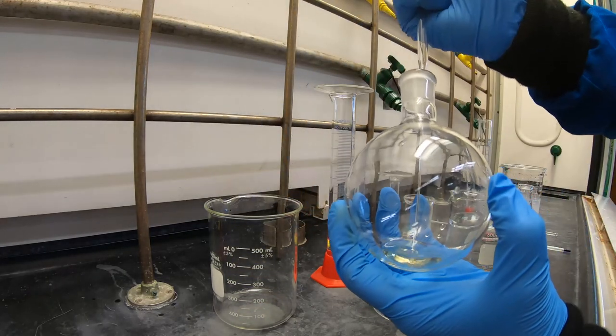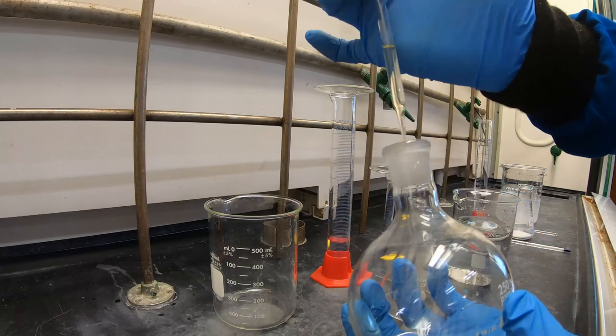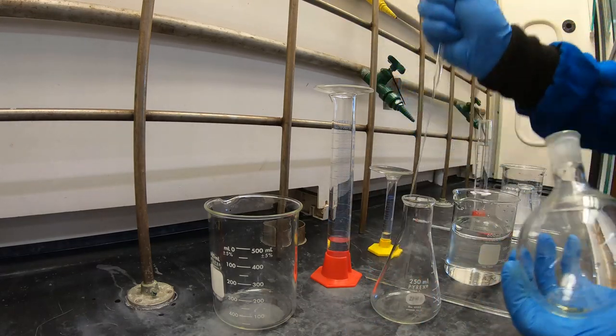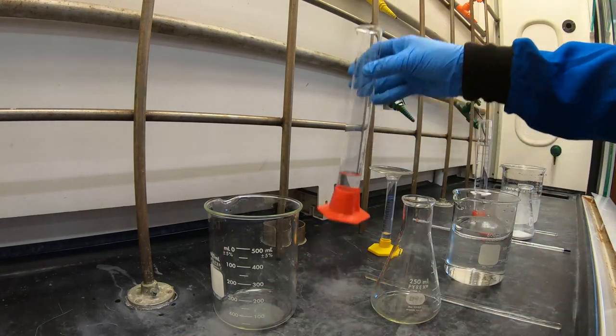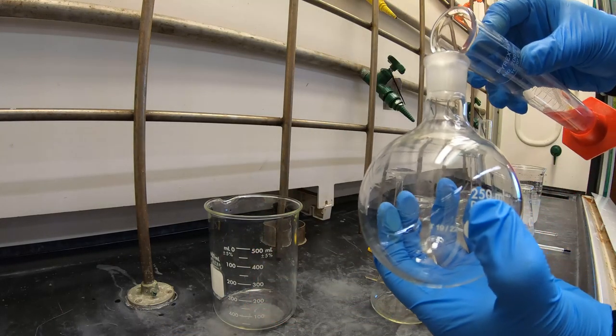Transfer your 2,6 dimethyl aniline to your 250 mL Erlenmeyer flask using a pipette. Then add 25 mL of your glacial acetic acid using a portion to rinse your round bottom flask.